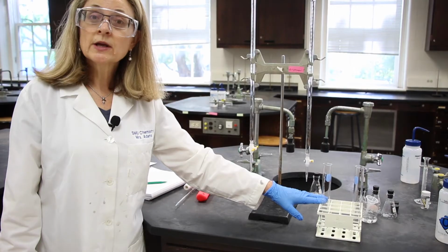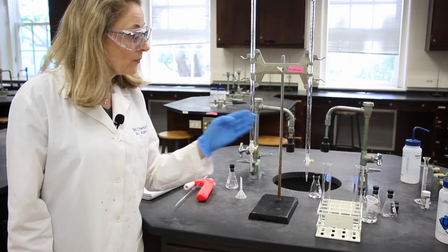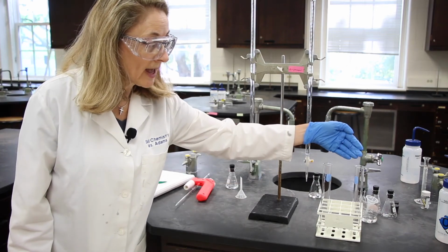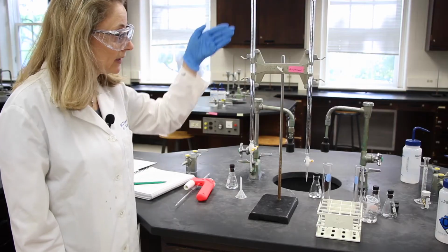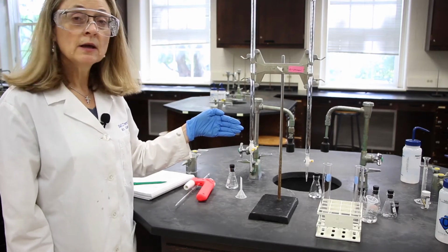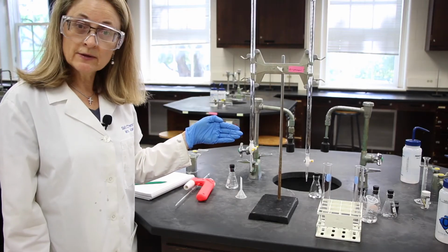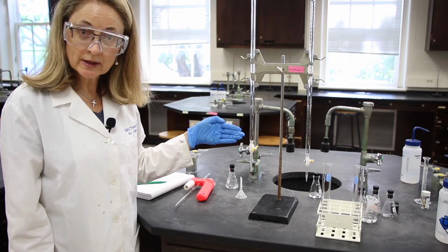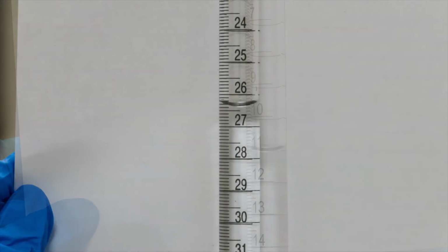I'll drain water into both of them. Something that you need to be aware of, before you start adding to your second test tube, be sure you have at least 30 milliliters, which is the amount I need, available to deliver in the burette. If not, refill the burette and make some new readings. Carefully read and record the following 8 measurements in the appropriate box in your data sheet.